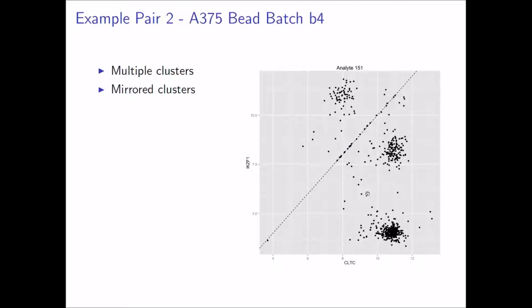I've done some looking, and for example, for this one, there are single plates with multiple untreated controls, and there are single plates that have some in the lower cluster as well as some in the higher cluster. So it's not just an artifact of different plates being done differently. Experiments on the same plate show up in the different clusters.